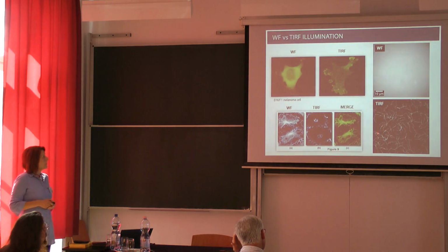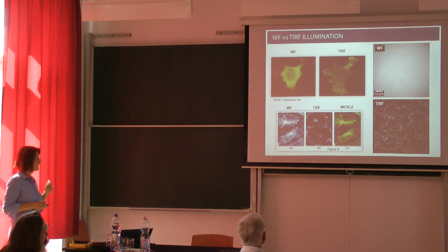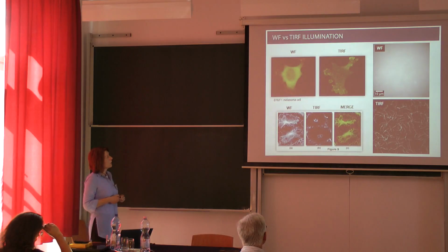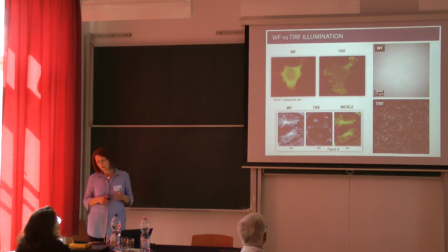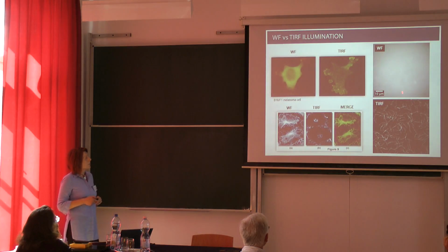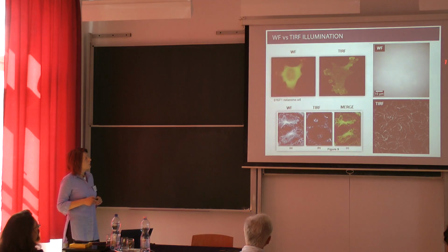And there is another pair of images, actually related to our research, which is focused on cytoskeletal polymer dynamics, including actin and microtubules. This is a cell-free system that contains actin filaments, fiber-like structures, and when we illuminate with a wide field microscope, this is what we can see.